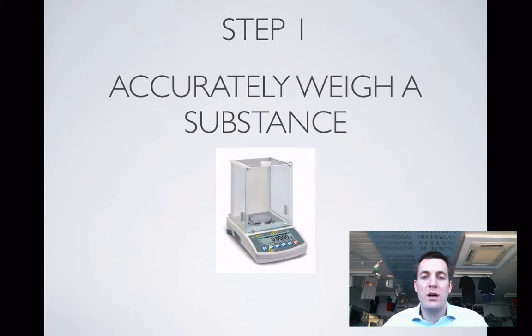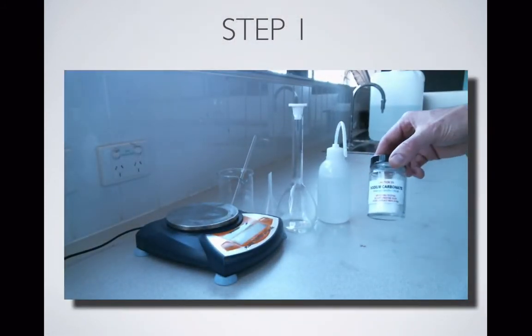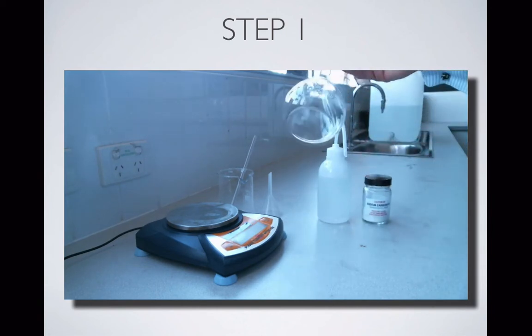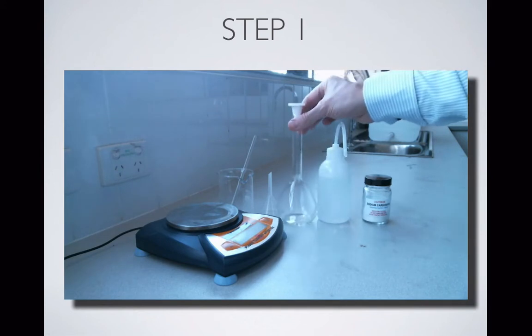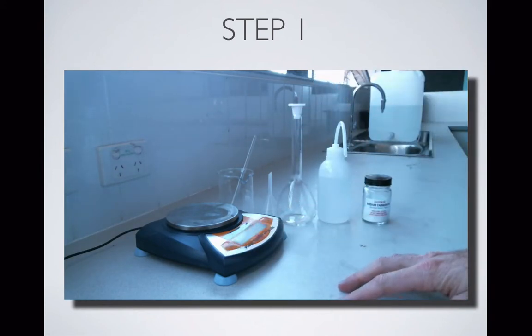We're going to start off by taking a substance called a primary standard, and we're going to accurately weigh it out. I'm going to be using anhydrous sodium carbonate, which, as you'll see in the next film, is a good primary standard. I'm using a 250 ml volumetric flask to make a 0.1 mole per litre solution. So in other words, I want about 0.025 moles to be in my flask.